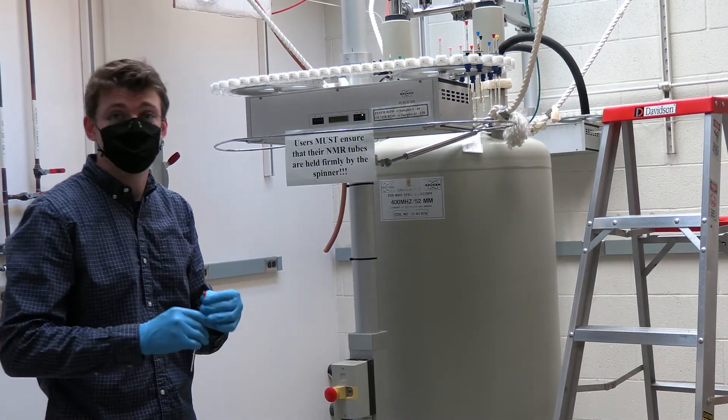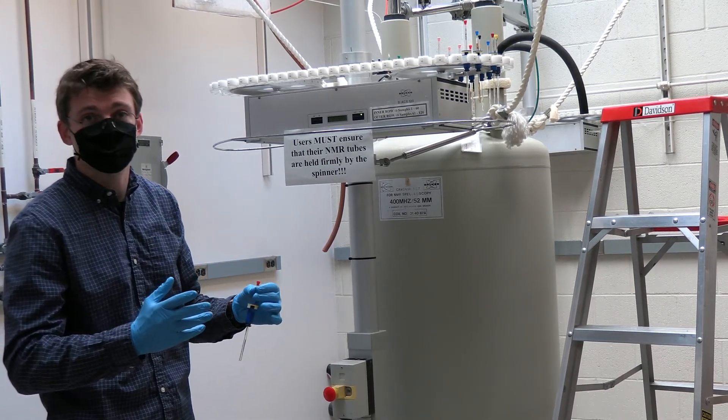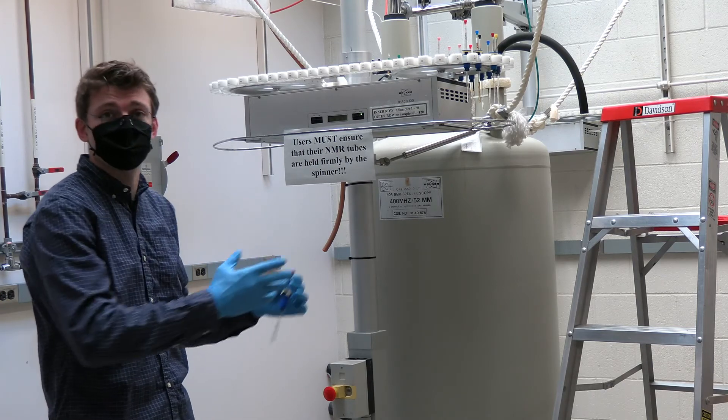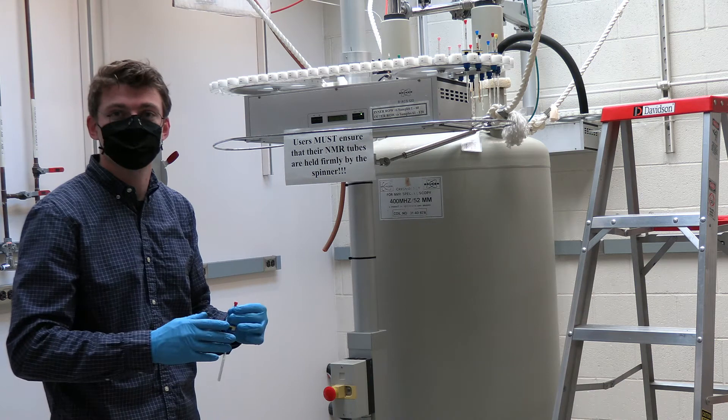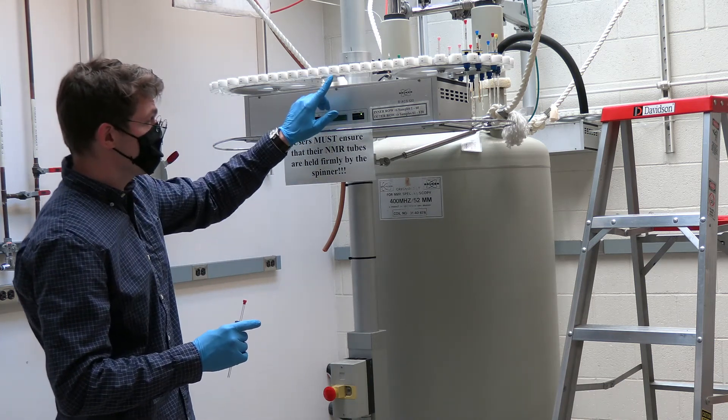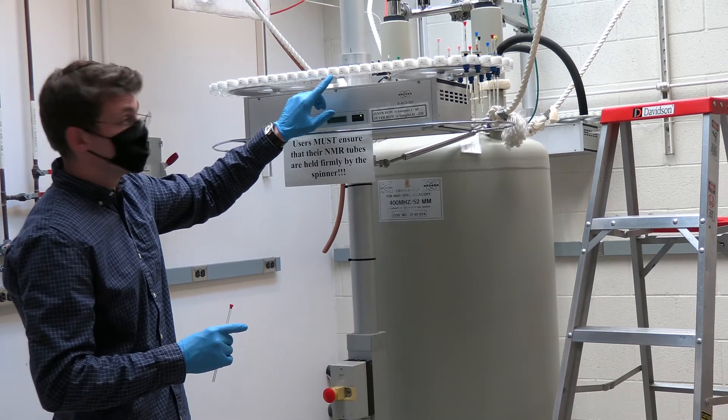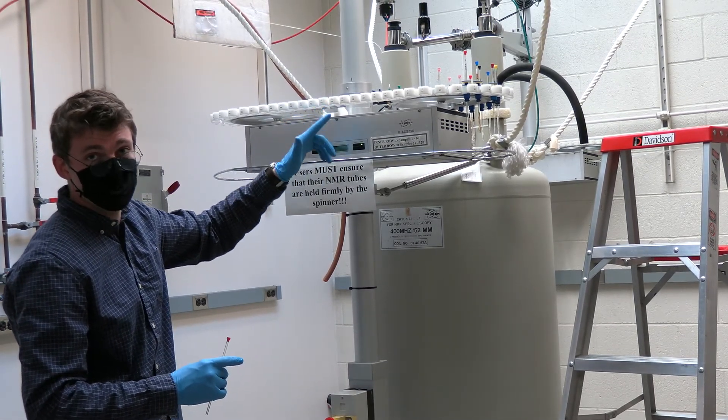Throughout a given day we run samples sequentially 1 through 120. This makes it easy for users to quickly access where their samples should be placed while also allowing for easier use of the software. Each position is labeled with two numbers. The top number corresponds to the inner row while the bottom number corresponds to the outer row.